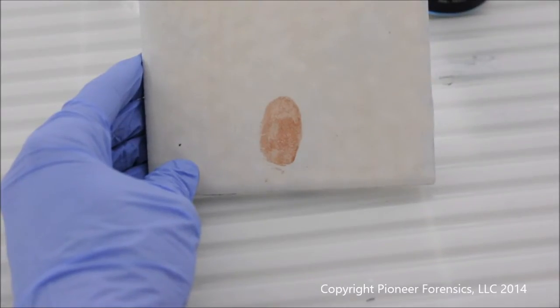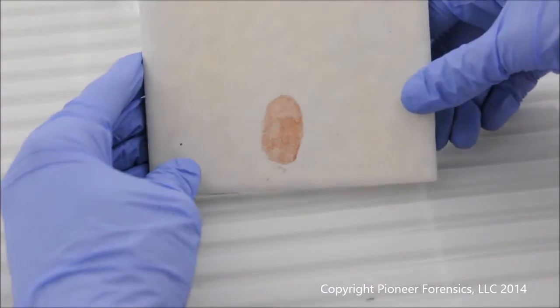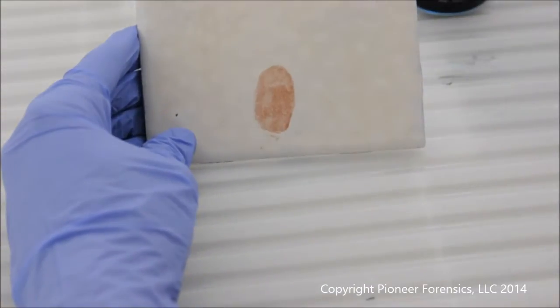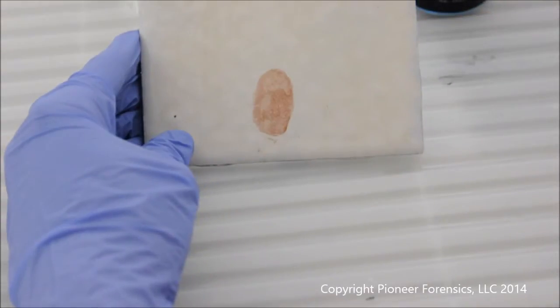In this video, we're going to be looking at the process method known as Kamasi Blue Staining. This is a protein stain suitable for developing bloody impressions, fingerprints, footwear, anything that's left in blood. It is a very high contrast stain and it has several easy applications that can be used both in the field and in the laboratory.